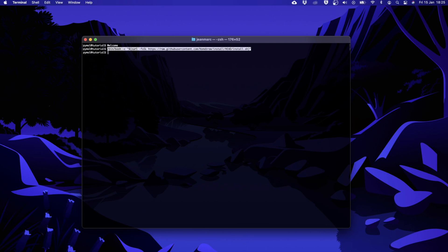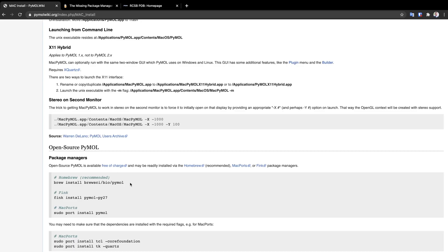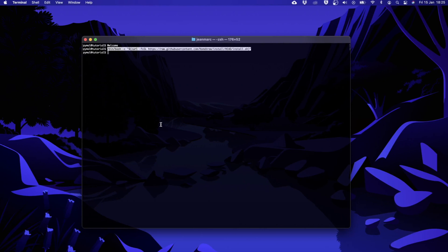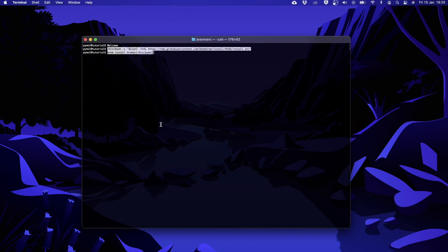Once you are done with it we can proceed to the next step which is to install PyMOL with homebrew that we just installed. Again here we just copy the line from the PyMOL wiki, paste it into the terminal and we run it by pressing enter.